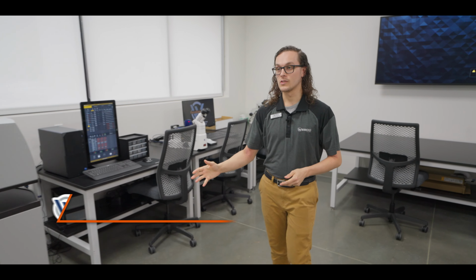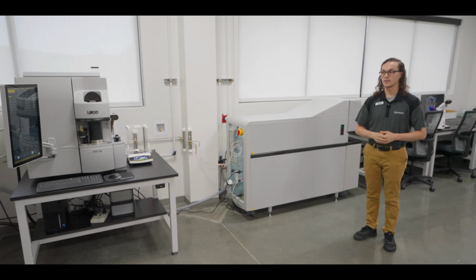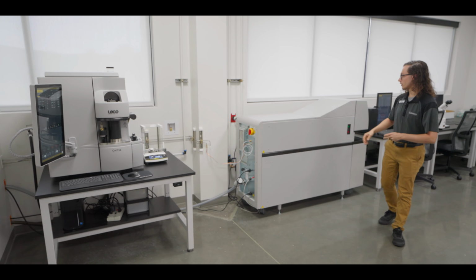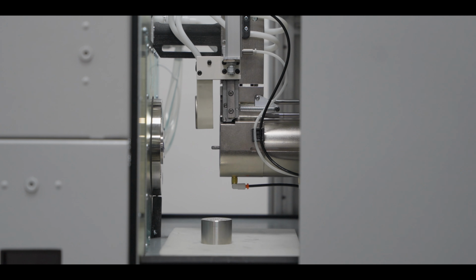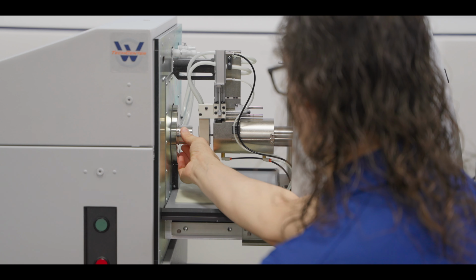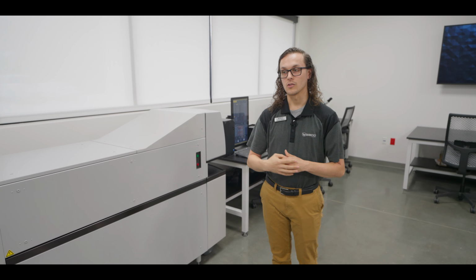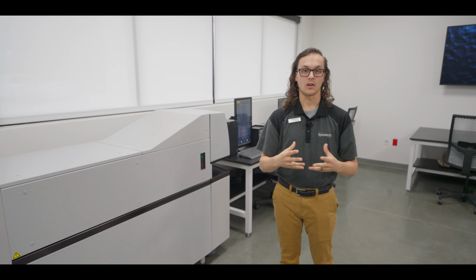And the last two machines in this lab are the chemistry machines. These two machines combined tell us the elemental chemistry of our samples. The spectrometer tells us our heavier elements like iron, chromium, nickel, copper, while the ON736 tells us oxygen and nitrogen, two gaseous elements that are dissolved into the steel surface during casting.